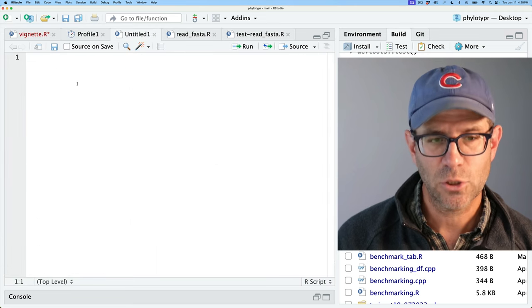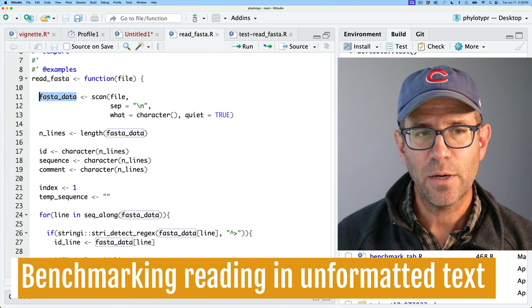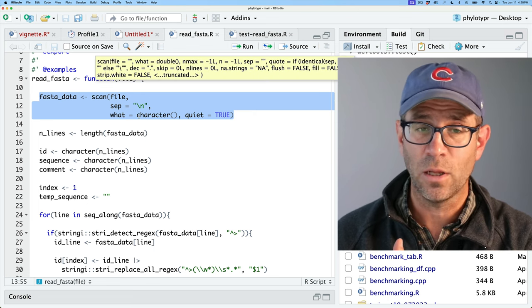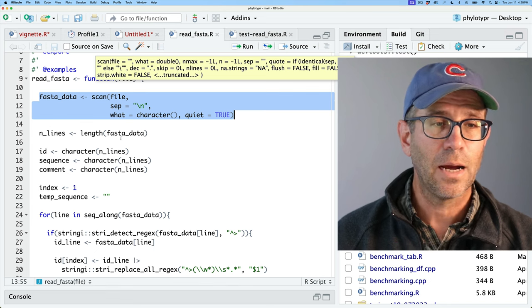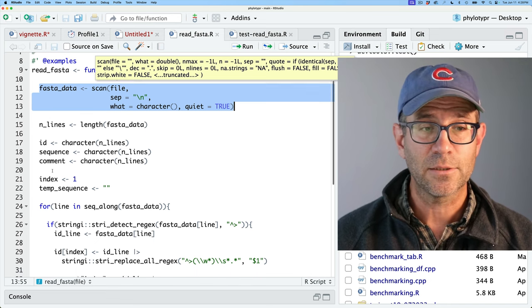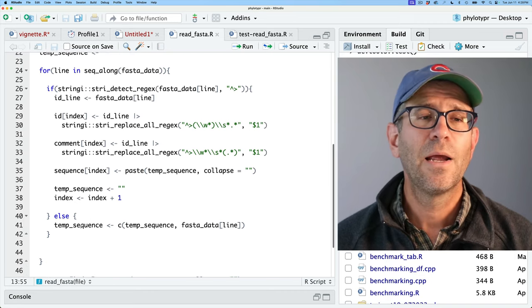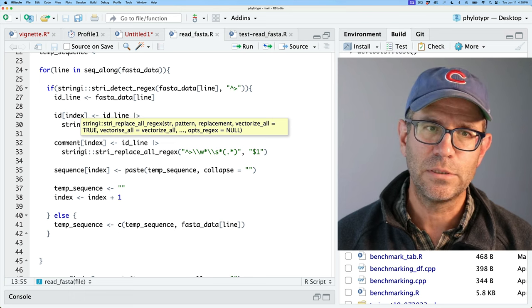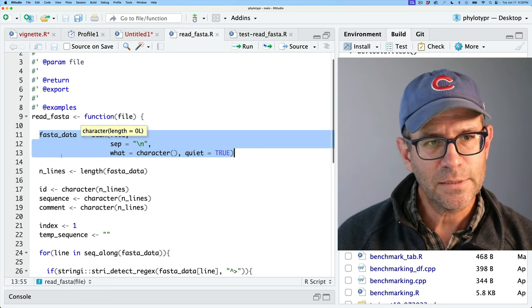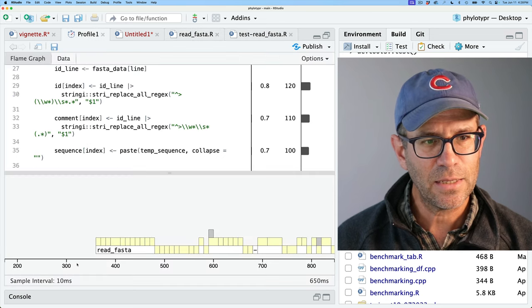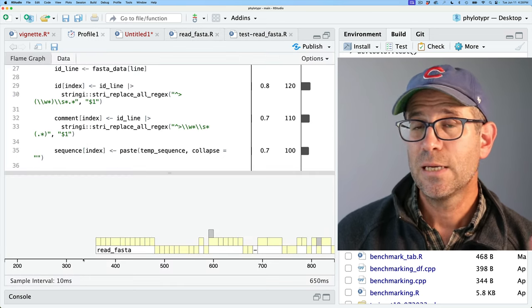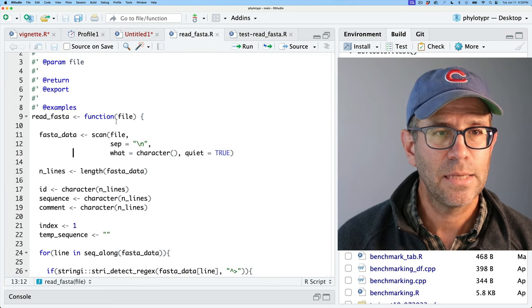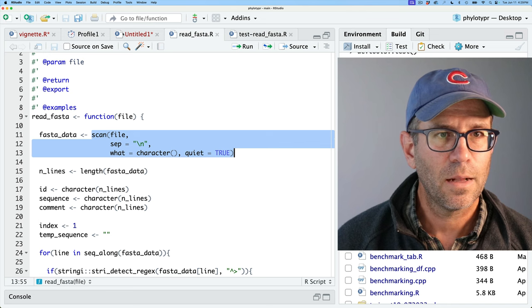In read_fasta, we're generating a vector called fasta_data from the scan function, which basically reads in all the data from the file. It gets the number of lines, initializes the vectors, and then loops through fasta_data trying to figure out if each line is a header or a sequence and parsing it accordingly. I think this first 350 milliseconds or so is spent in scan, so let's benchmark that specifically.